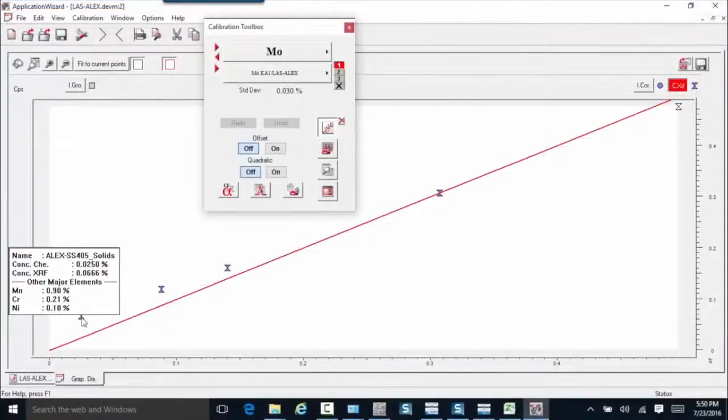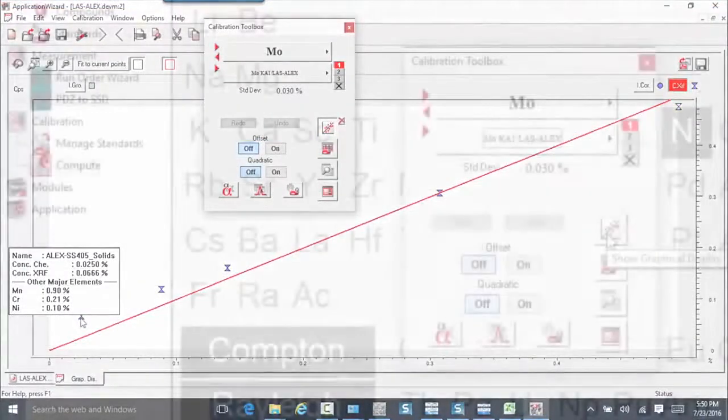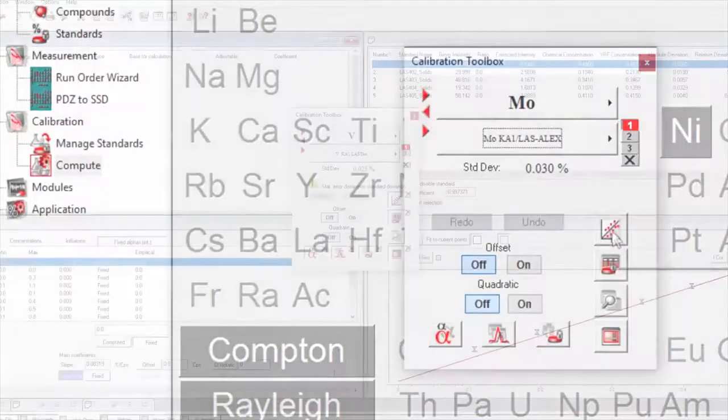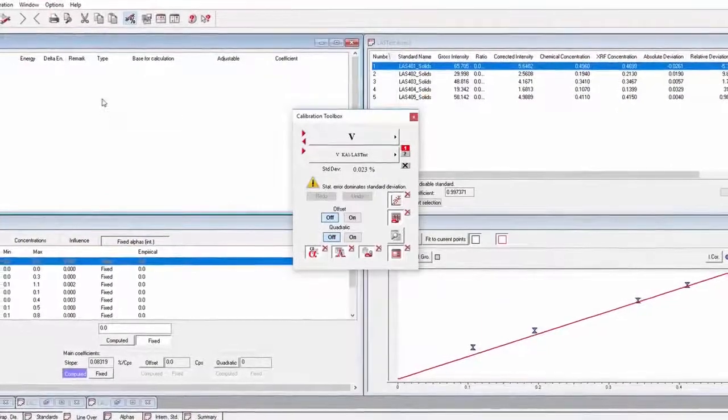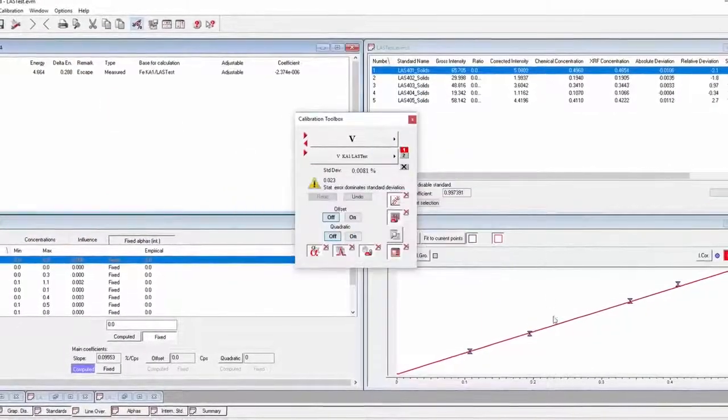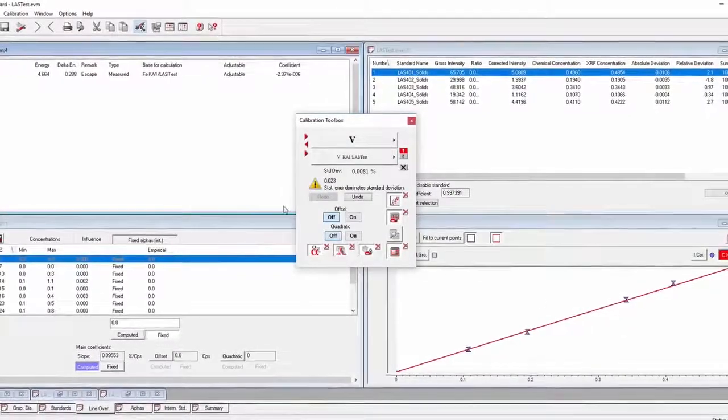Optionally available EasyCal PC software allows for user-defined and site-specific empirical calibrations. EasyCal incorporates Lucas-Tooth modeling and provides comprehensive tools for inter-element corrections. The instructional wizard walks the user through EasyCal's calibration process using a graphical interface.